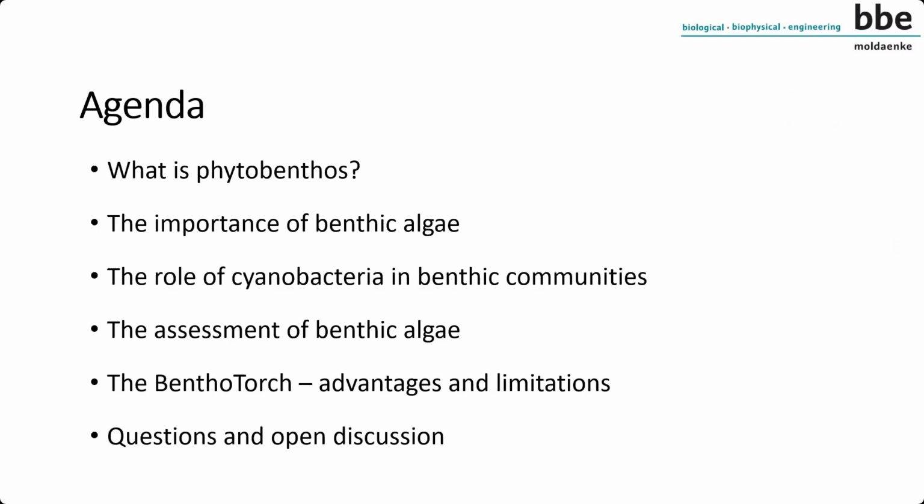And I want to go a little bit more into the details of the measurements. Of course, we have an instrument that was developed by BBE. This is the BenthoTorch instrument for measurement of these benthic algae, especially the microbenthoalgae. And of course, at the end, we would like to invite you for any question or open discussion.